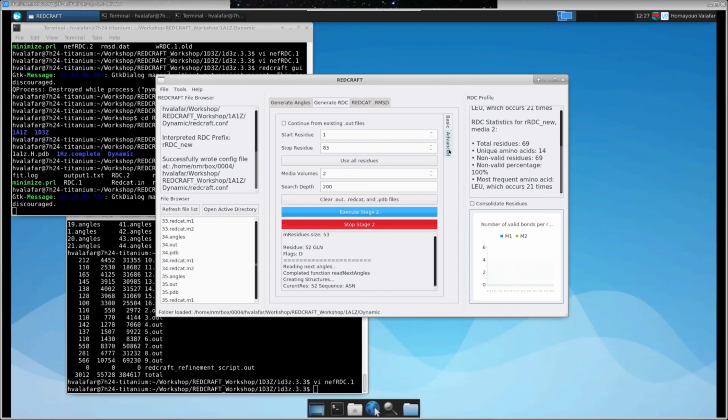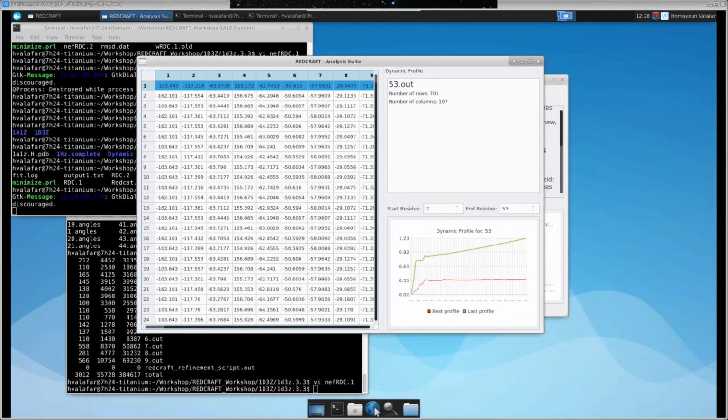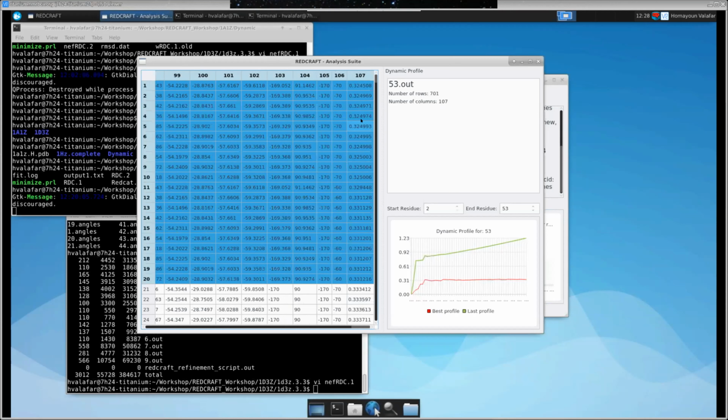Now, what we have done in the past, when we deposit structures to PDB, it says you need to give us an ensemble since it's an NMR method. So for example, at 52, we have a single PDB, but that single PDB corresponds to this first line. So what we do then, we create a structure from the first 10 or 20, and here are all the structures that are within some X variation. At that point, RDC fitness varies anywhere from 0.32 to 0.33. So we just provide that.